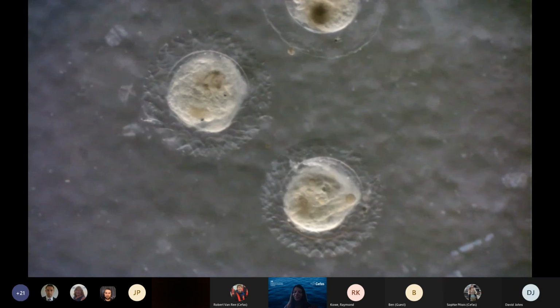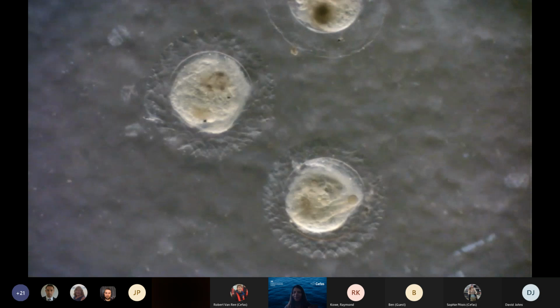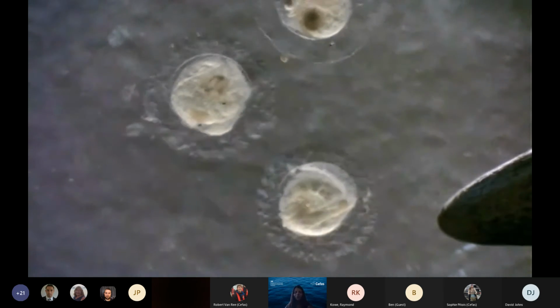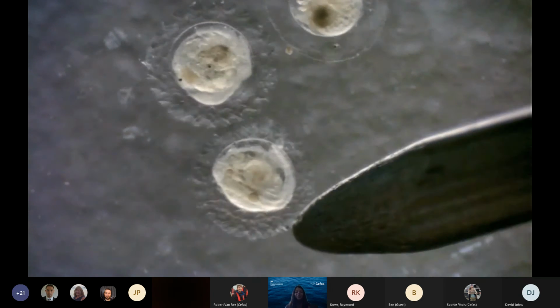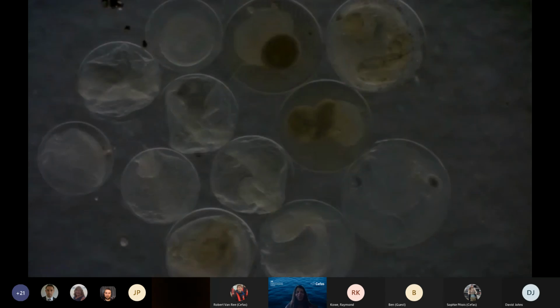Right, so now we move on to this video, where hopefully, as you can see, some fish eggs can look quite distinctive and beautiful. The eggs shown here come from an offshore species of fish commonly known as pearlside, whose eggs also rather live up to their name with their somewhat iridescent and patterned shell.